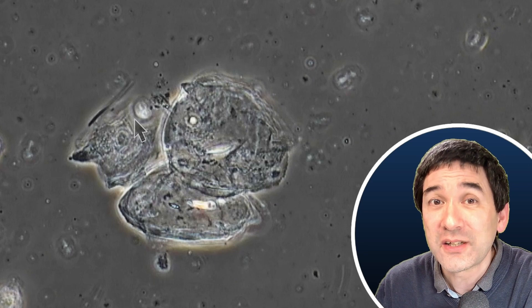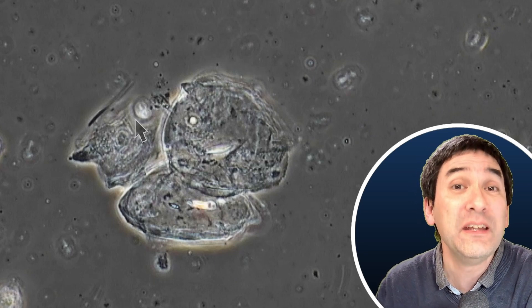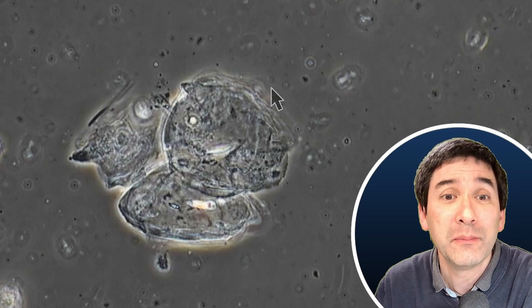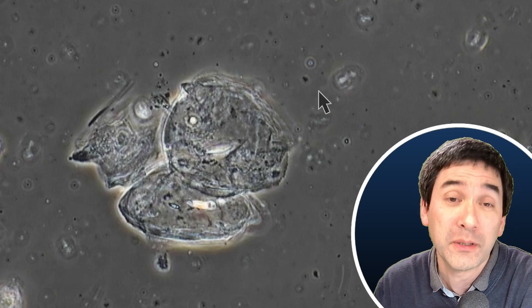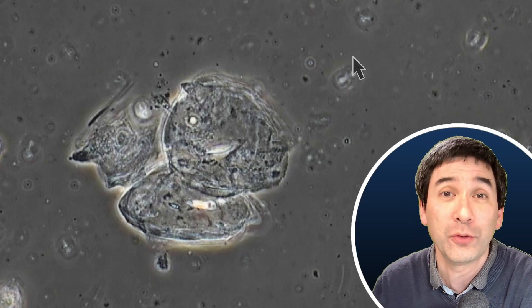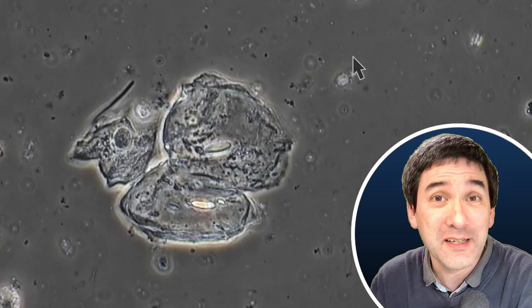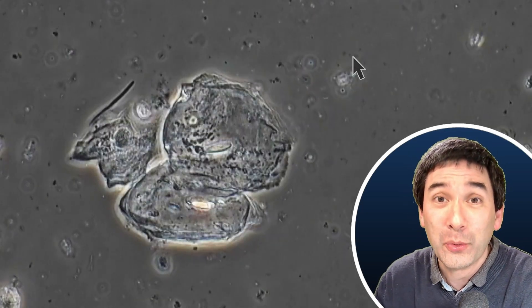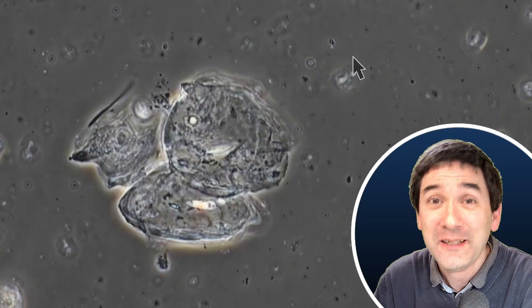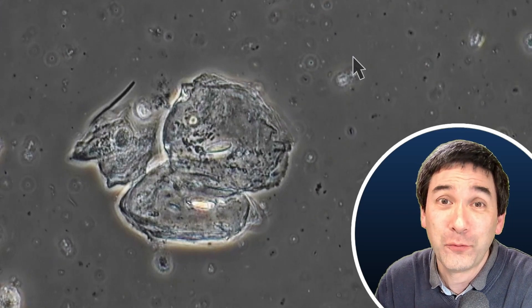There are other cells also in this picture that are significantly smaller. Do you see this dark little line over here? That is a bacterium, and many of those other dots floating around in the background are, as a matter of fact, bacteria. The mouth is an ideal place for bacteria because it's not only moist and warm, but there is also plenty of food present. This is a whole ecosystem for bacteria.